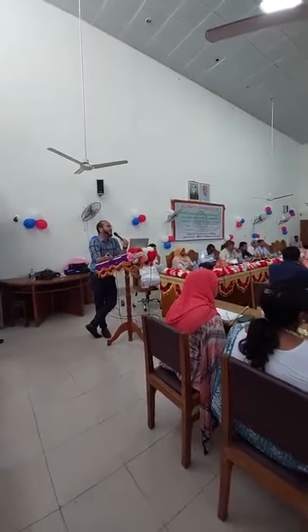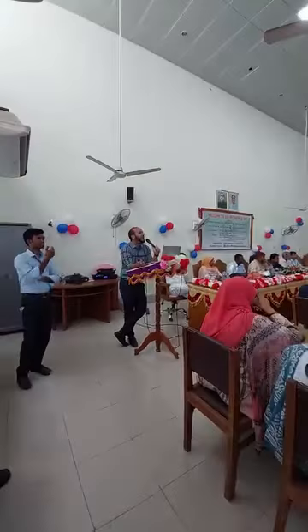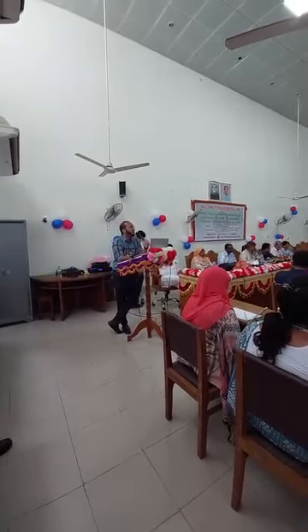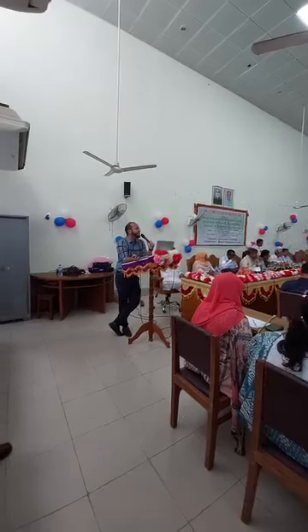We collect the cells from the surgical field and immediately spread them on the slide, followed by 95% alcohol fixation and immediate short staining, followed by microscopy. Therefore, we can say whether cancer cells are present or not, besides the frozen section. Where frozen section is absent, we can do imprint cytology alone. It can help the surgeon on the operation table.